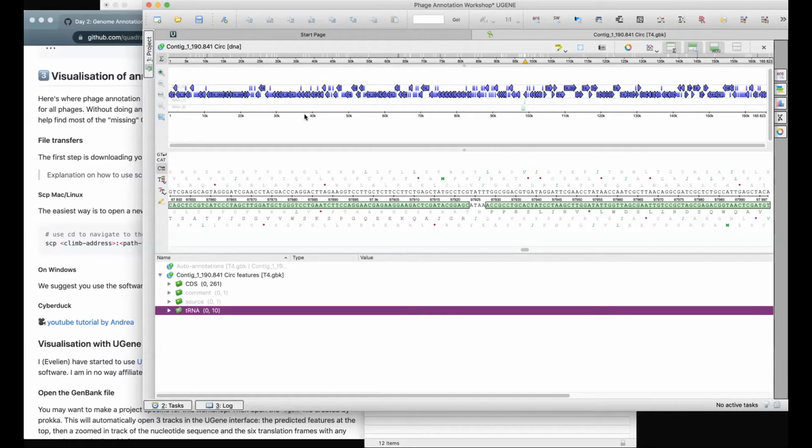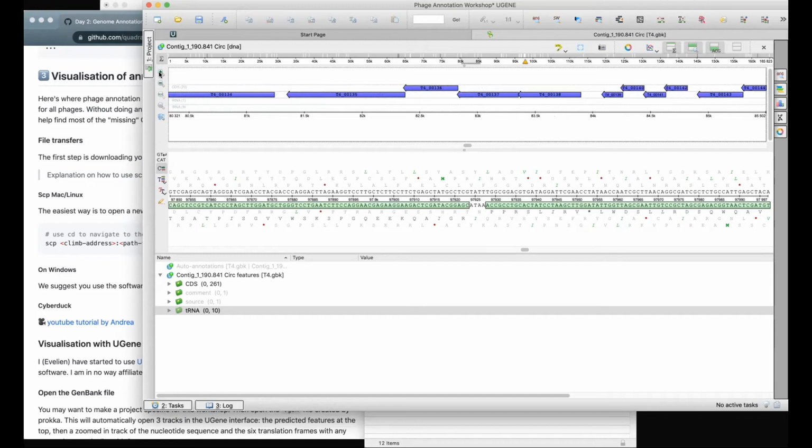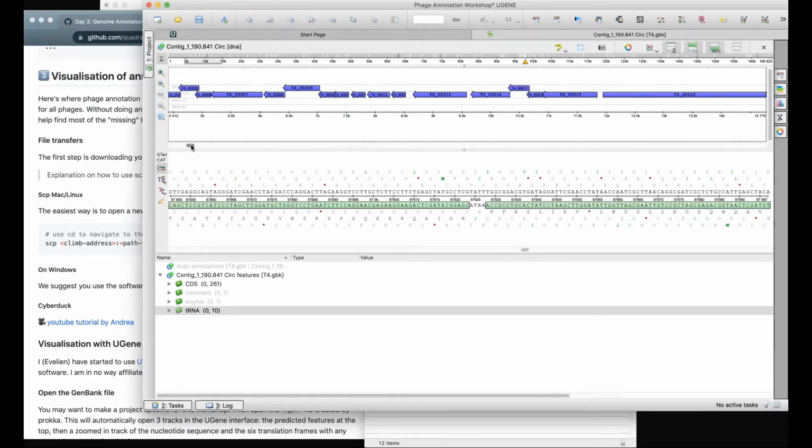Okay, so now we're going to follow the, let's say, the Kropinski method of scrolling through your genome, and have a quick scan at whether we think the coding sequence predictions are good. And I'm going to zoom in to a manageable distance of about, let's say, 10 kb at a time. And we can see that it actually does look good. There are some gaps. Not too big.